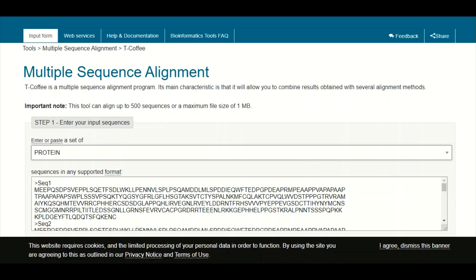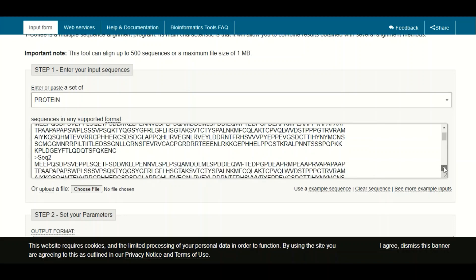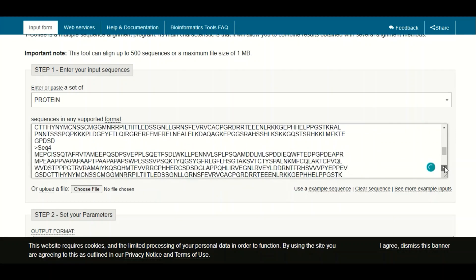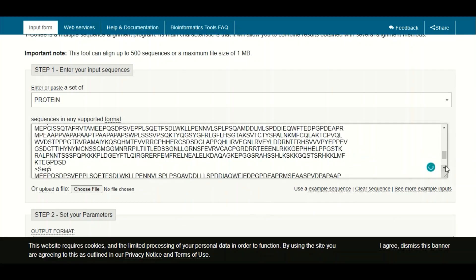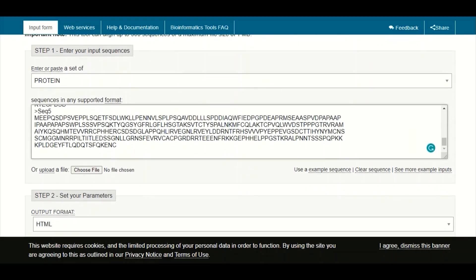In the box below, we have to submit our protein sequences in FASTA format. As you can see, we have pasted five sequences in FASTA format in this box, and for these five sequences we want to perform the multiple sequence alignment.